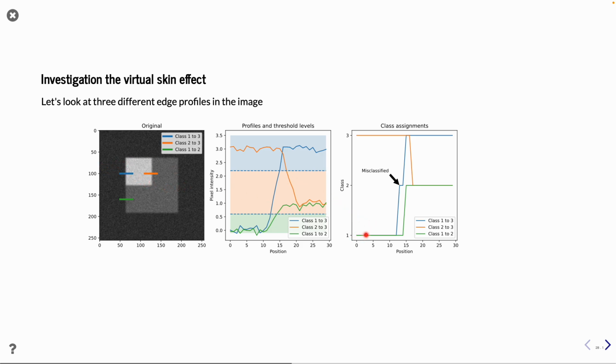So what you get then is when it tries to go from the dark, it passes through the orange or mid region, and there it produces pixels in the middle class. And then it goes on to the highest intensity class. And well, this is the uncertainty we have with the blurring. And now we need to find a solution for how to handle it.